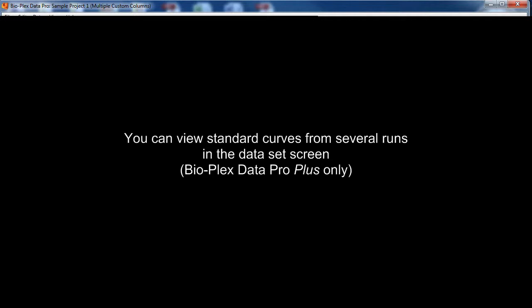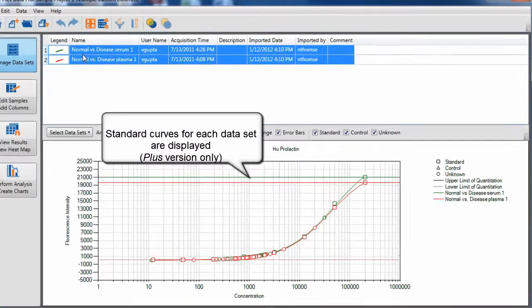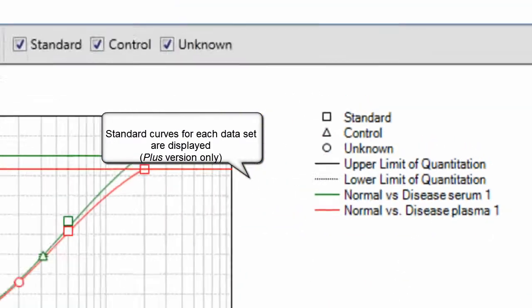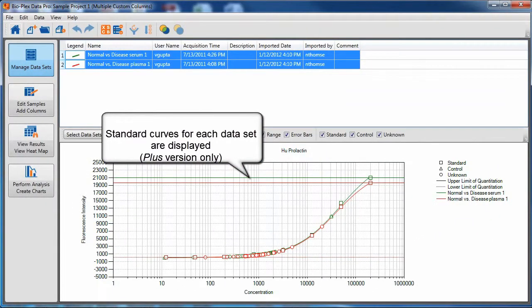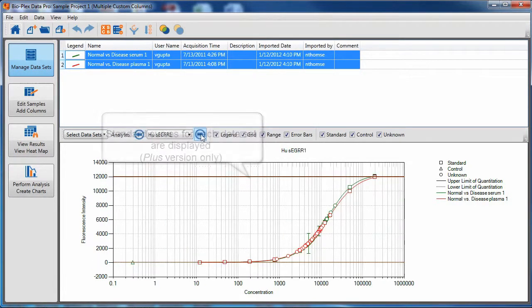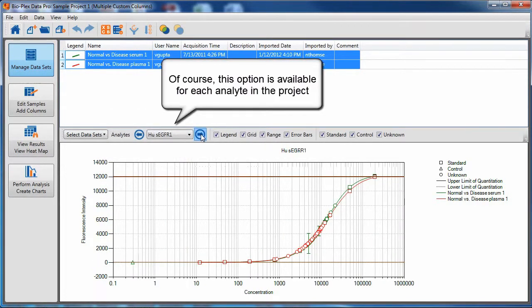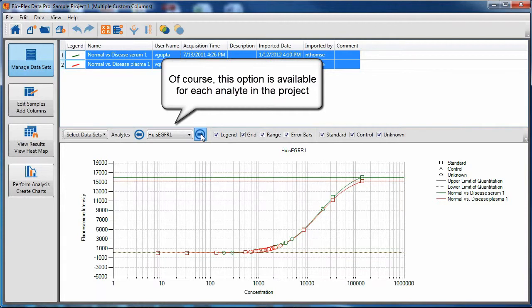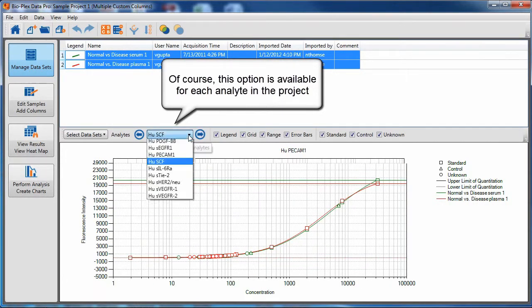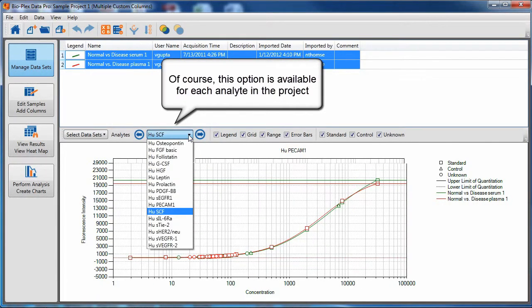You can view standard curves from several runs in the data set screen if you have Bioplex DataPro Plus. Standard curves for each data set are displayed in the bottom pane. This is available for each analyte in the project for as many data sets as you require.